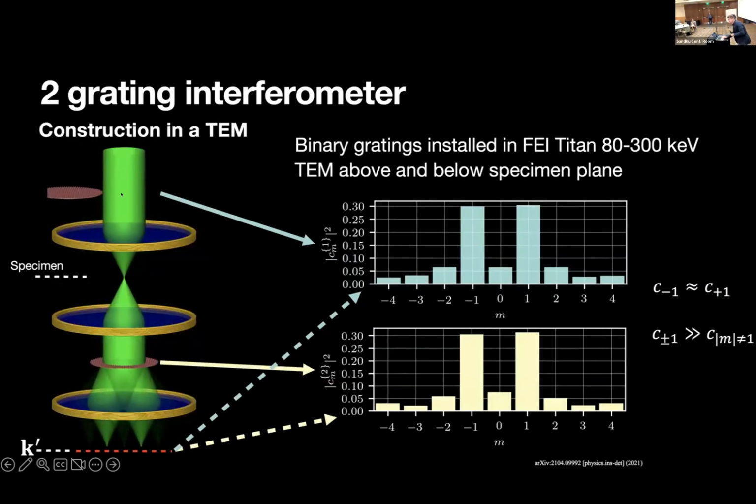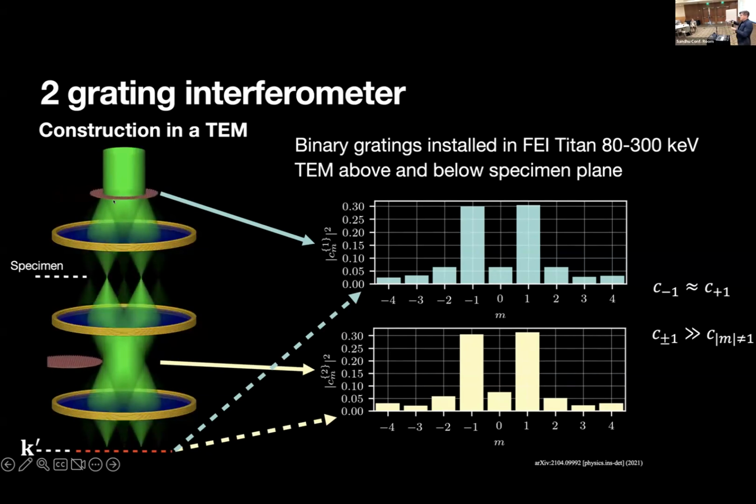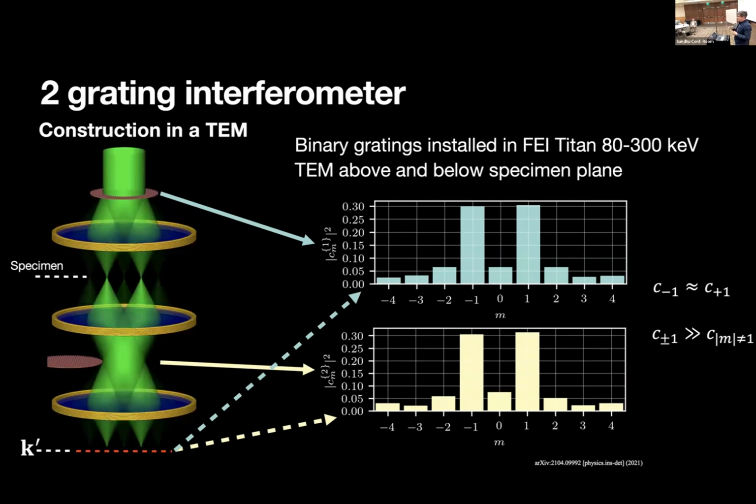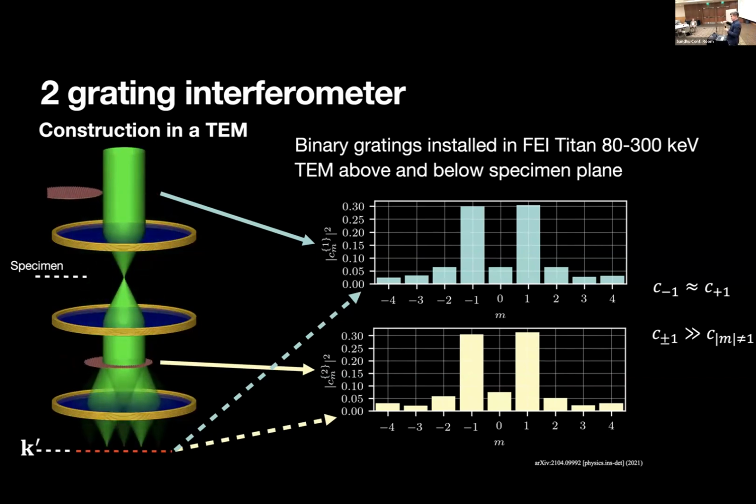Here's one. The lenses are pretty complex. They've got a magnetic field shaped around a huge coil of copper. You're running tons of current on it. However, all of that is to get as close as possible to an idealized circular loop of current. Like in your introductory physics E&M class, you have to figure out the magnetic dipole field from a current loop.